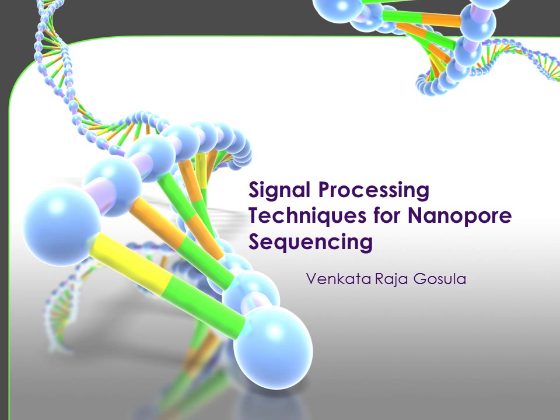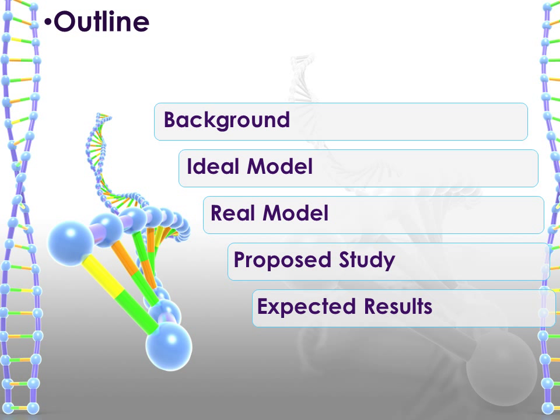Signal processing techniques for nanopore sequencing. I'm Venkata Raja Gosula, and this is the topic of my presentation. First, I'll give you a little background, talk about the ideal model, real model, proposed study, and expected results.